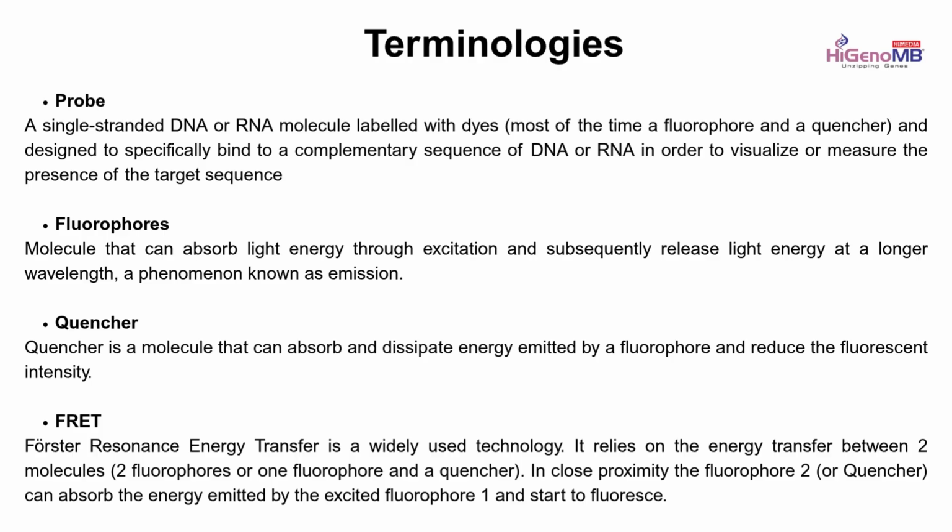So the fluorescence emitted by these fluorophores will be quenched by a molecule called a quencher. The quencher's job is to catch all the fluorescence that is being emitted by the fluorophore and not allow any of this fluorescence to be emitted outside.